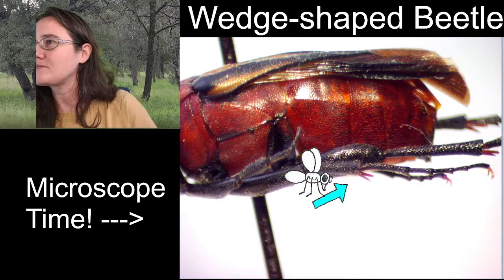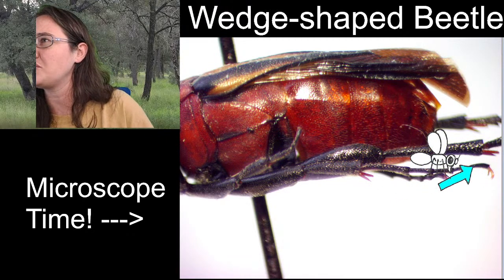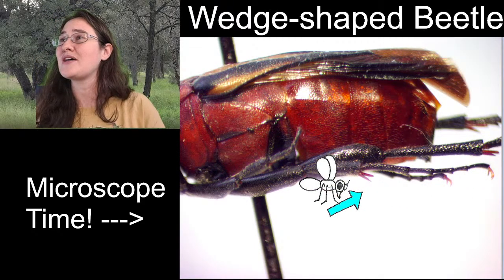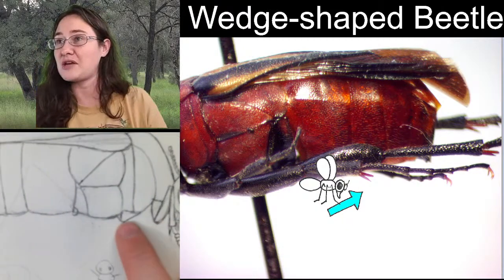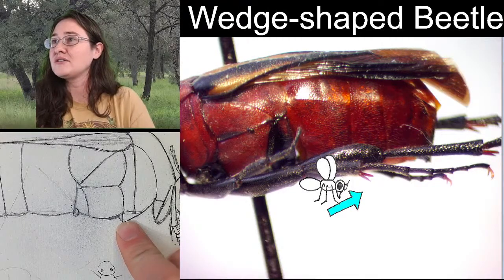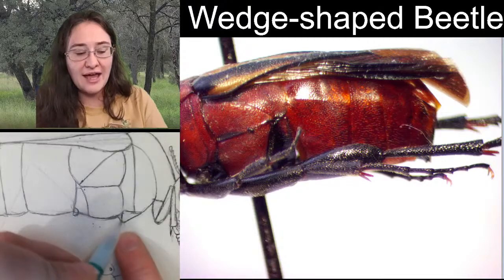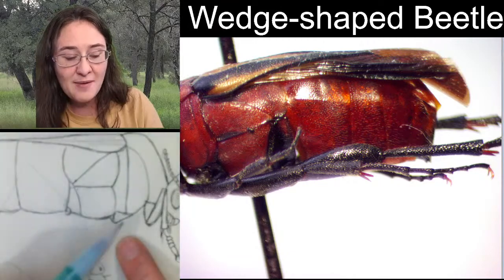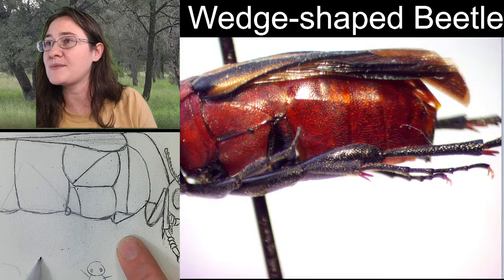And then you've got these tarsal segments, and it looks like 1, 2, 3, 4, 5 tarsal segments and the claw. It's just that these ones are significantly longer than the front leg's tarsal segments. So for here, we're going to be adding our leg to the very end of this coxa, and it's going to be coming up towards our body and then back down, and we'll have the tarsal segments coming out here like they're walking on the ground.